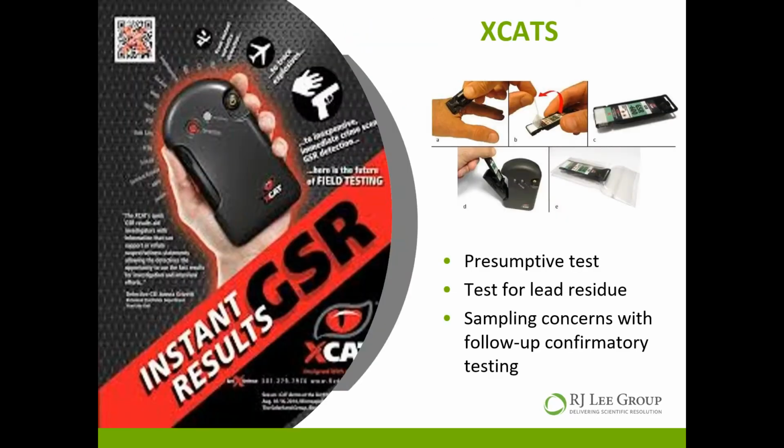Okay, more recently I've gotten questions about this particular device. This is known as the XCAT, and it's so tempting because it says right there, you get instant results as to whether or not someone has GSR in their hands. So my answer as to whether or not I would recommend XCATs, my bottom line answer is I recommend GSR SEM stubs over this device.